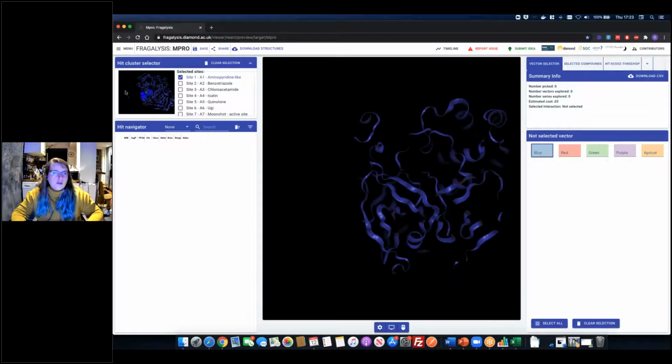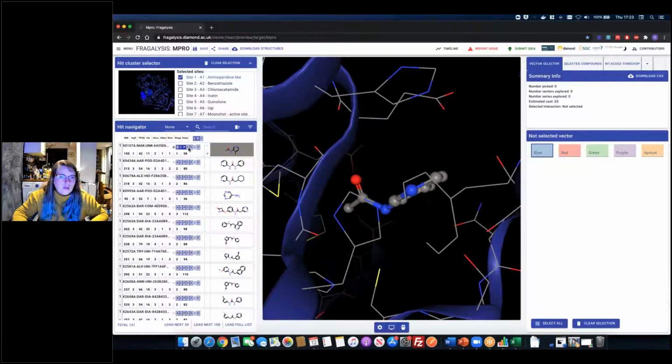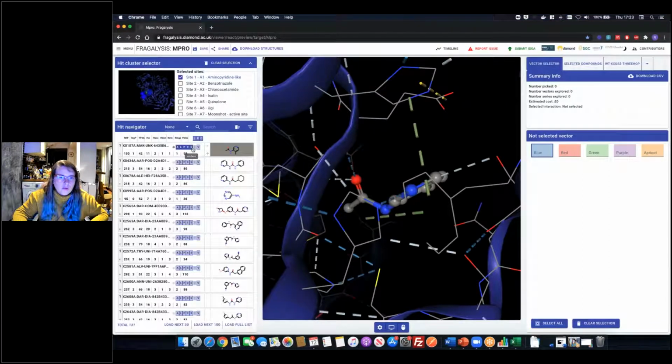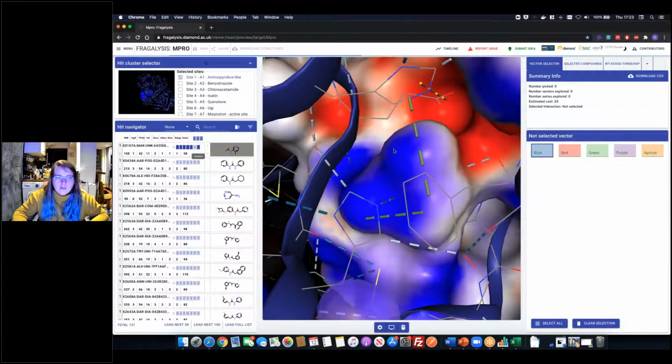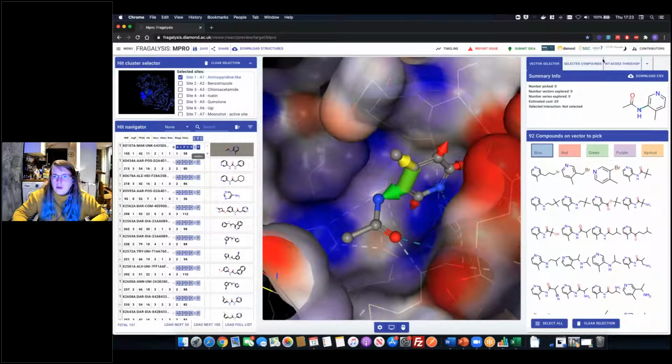Excellent. So let's very quickly turn some stuff on that looks a bit different from default. Let's say I have started with a ligand and I've turned on a molecule I'm interested in.